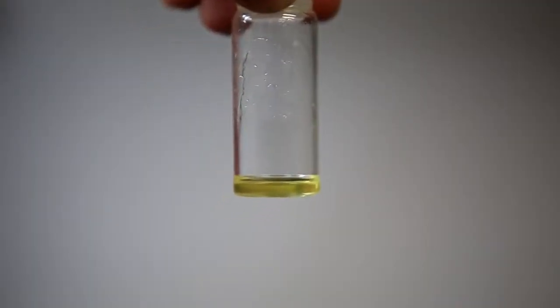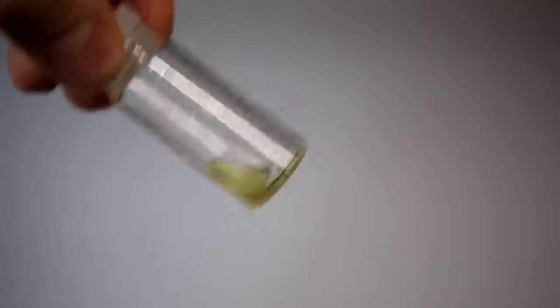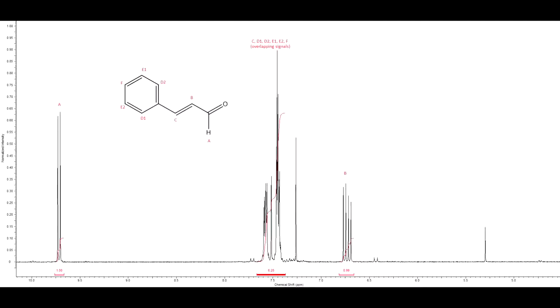After all this work I was left with nearly pure 0.5 grams of cinnamaldehyde. An HNMR of the final product shows that it is decently pure.